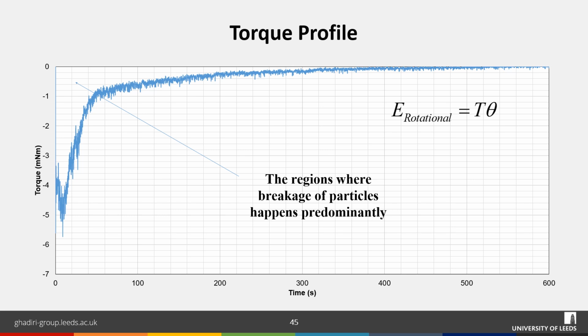With the FT4 rheometer, we can measure the torque of the impeller during the agitated filter bed drying process, and that gives us the ability to calculate the amount of work done by the impeller, or the energy that we put into agitating the powder bed. To shear a powder bed, a substantial amount of mechanical energy is needed, and that explains the initial spike of the torque recorded here.